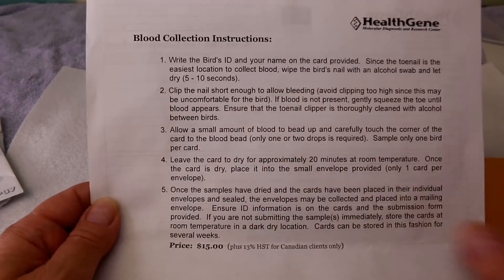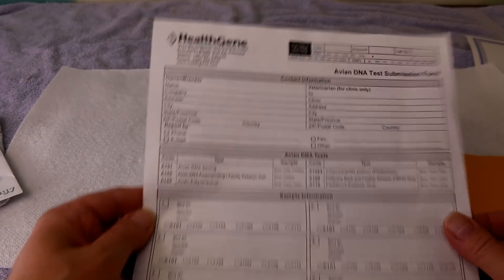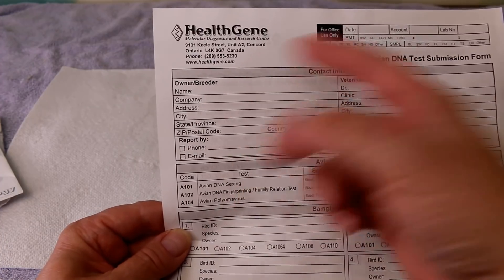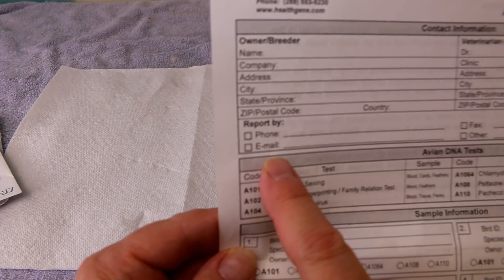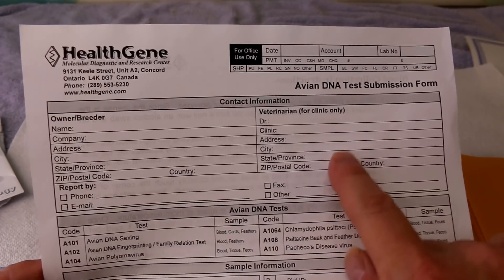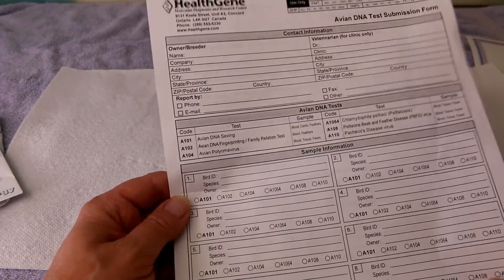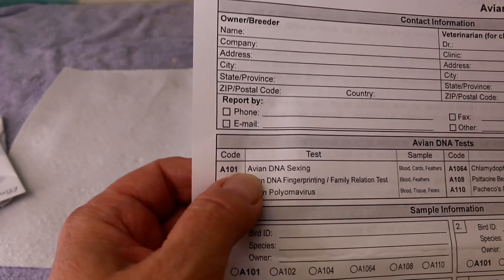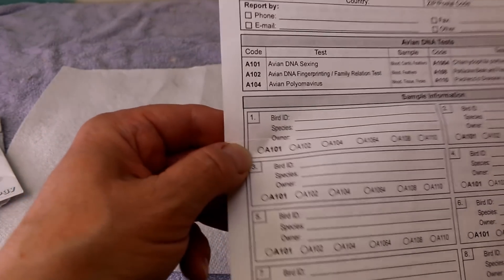I'm going to be doing blood collection today, which is from the bird's nails. This sheet tells you how to do it, which I'll be demonstrating. On this side you fill out your name, company name, or Aviary name — your address and contact information — and whether you want the report sent back by phone, email, or both. There's an avian DNA section, and the code for that is A101. It might be different with different companies, so make sure you look for the right code because you have to circle it.